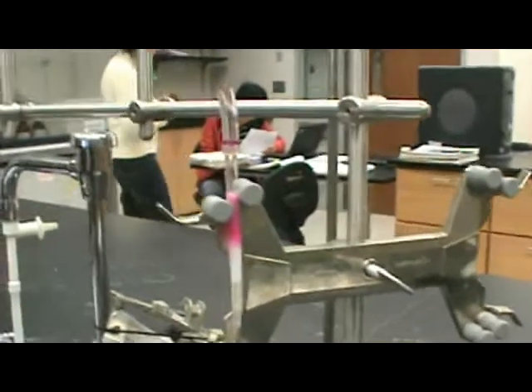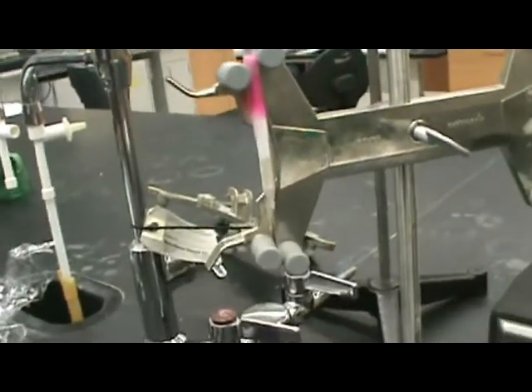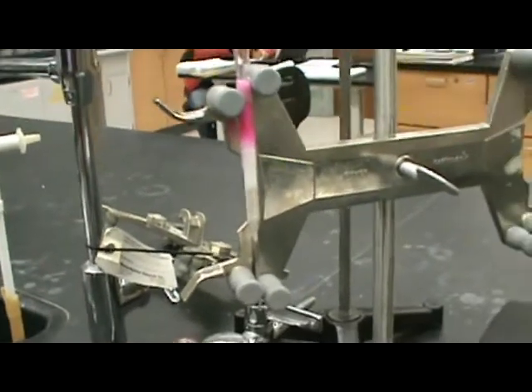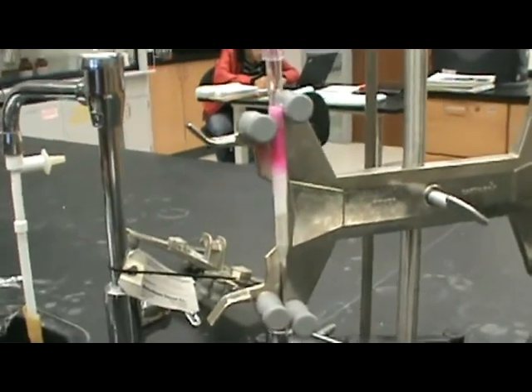What would you like us to do about it? Stop zooming in, I can tell. Look how precious this thing is. It's a column chromatography. I don't even know why we're doing it because we don't record anything, but it's here.